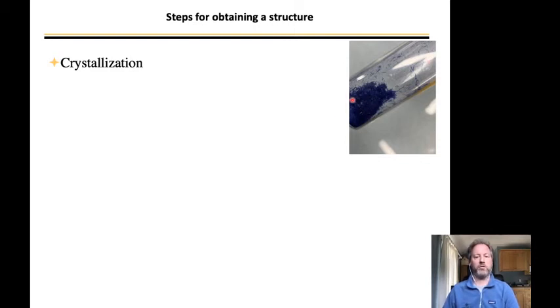And so you grow crystals from some solvent somehow. And I know I'm going to allude to this later in the week when I'm talking about a different technique. The hardest part about X-ray crystallography anymore is getting the crystals. If you've seen me using the diffractometer, you know that it's pretty straightforward. I can get a structure in about a day. So crystallization is definitely the slow step.